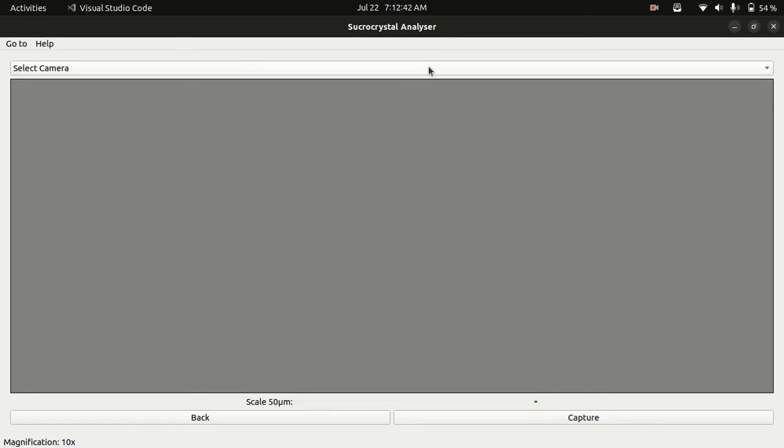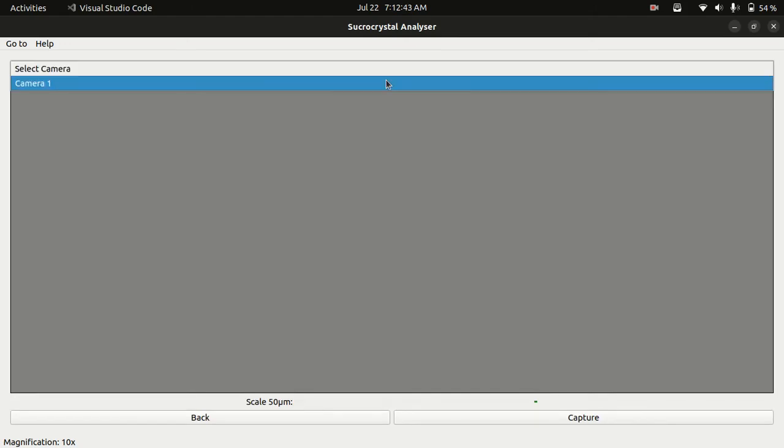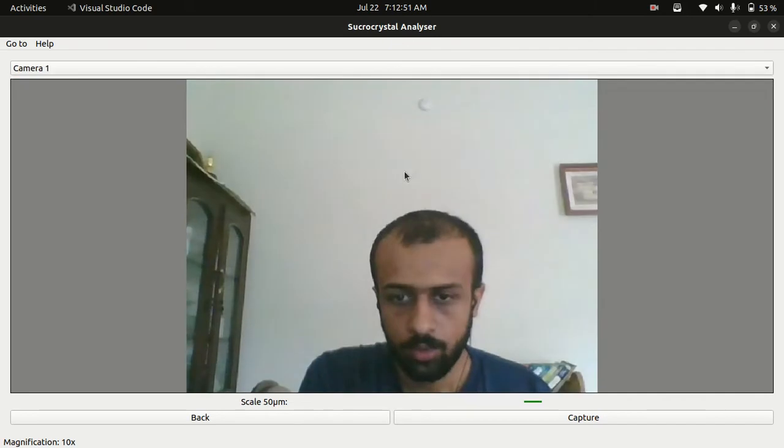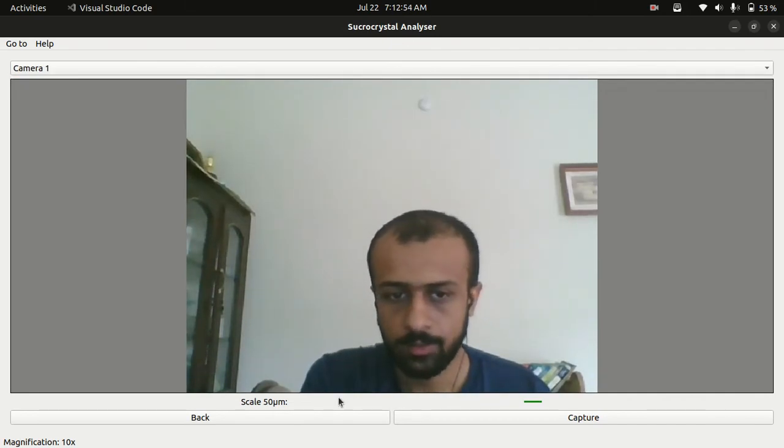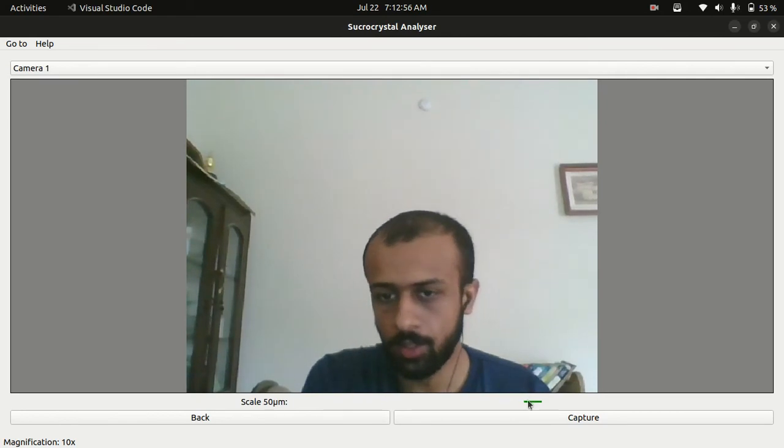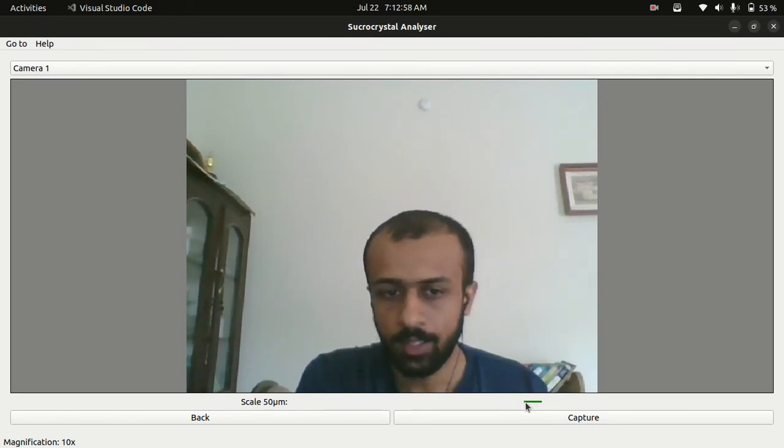We can select the microscope using the drop down menu. I don't have any microscope attached to my system, that's why it is showing me only one camera which is my webcam. Under the camera we can see the scale which is telling us how wide 50 micrometer looks like on the camera.